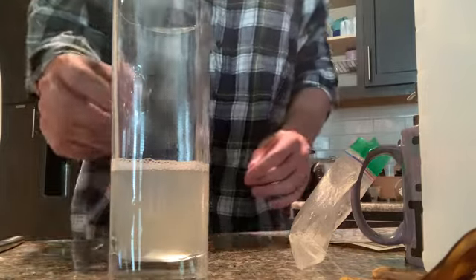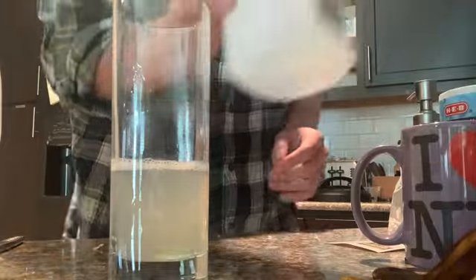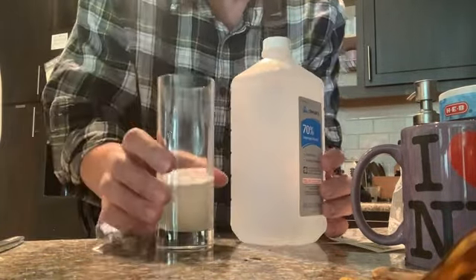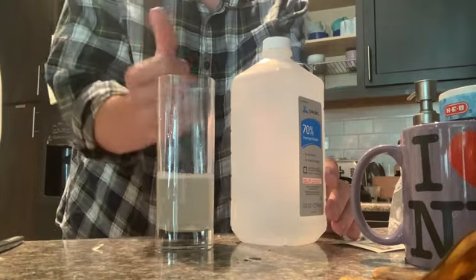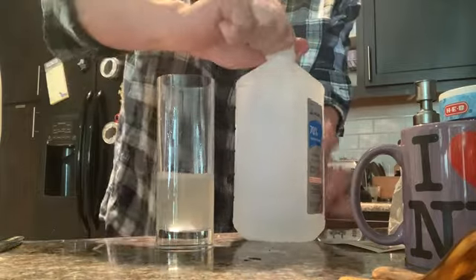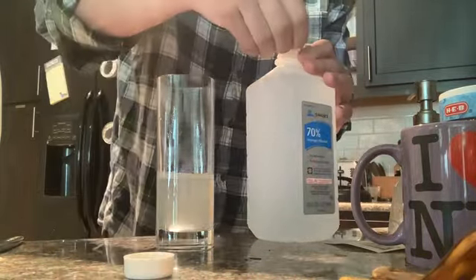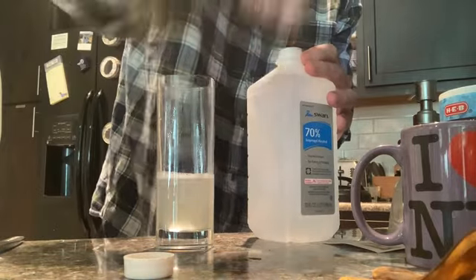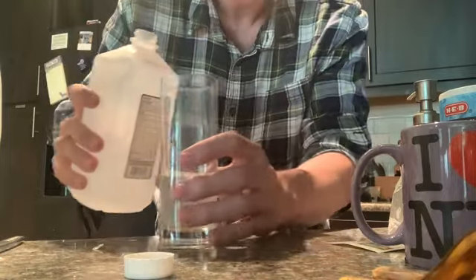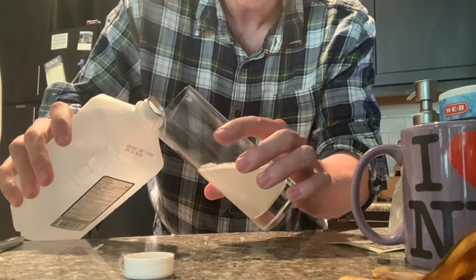All right. So, it's important to note that we are told not to just pour it straight into the cup. That's right. We're not going to pour it straight into the cup. We're going to tilt the cup slightly and then pour the alcohol along the side of the rim. Okay. This is brand new, so there we go. Tilt the cup and then slowly pour some down the side of the rim.